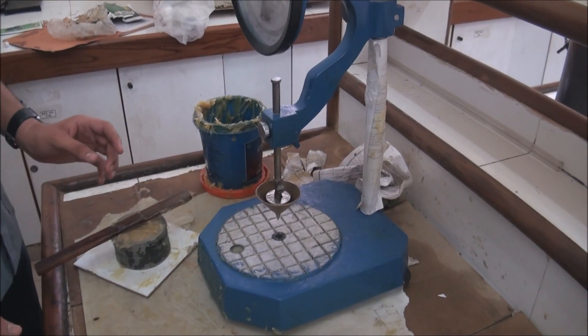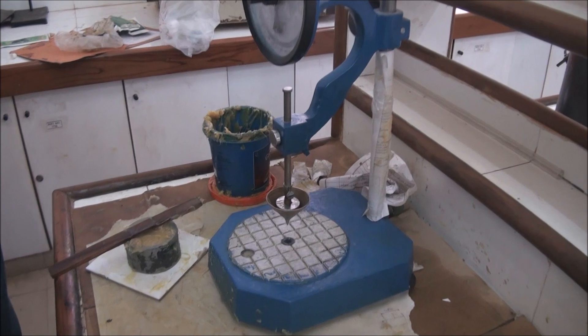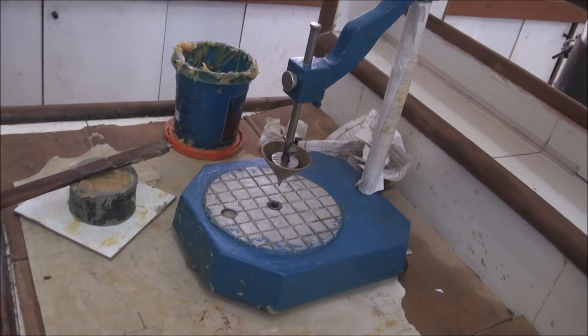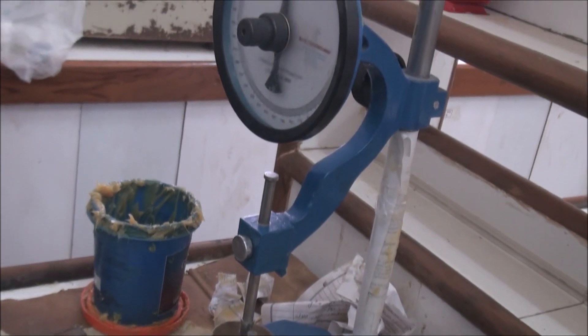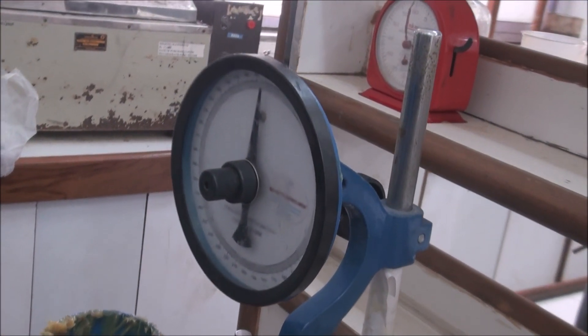The apparatus for the penetration index is described in brief. First comes the surface where we keep the bowl filled with grease for the experiment, along with the standard weight cone, the measurement needle, and the dial to note the readings.